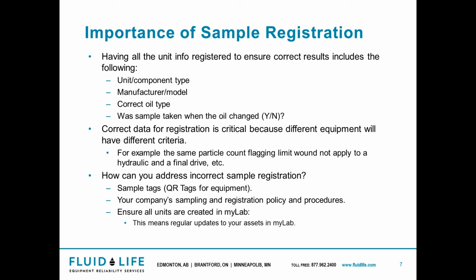So how can you ensure correct sample registration? We have these sample tags, these little QR code dog tags. Your company's internal sampling and registration policies and procedures, and ensuring all units are created in myLab. Now, this is probably going to be your most important one, and this means regular updates to your assets in myLab as well. I've been on oil analysis audits before where we go around and sometimes pieces of equipment aren't even there anymore, or there's new pieces of equipment that have completely different specs in its place. So it's really important to keep on top of that.